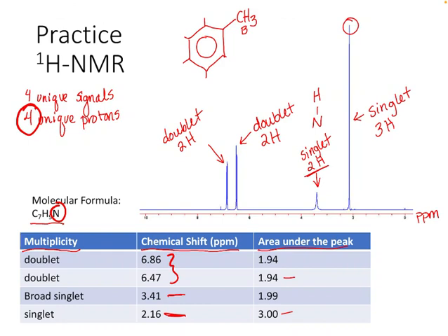Okay, so another possibility is that the nitrogen group, or the amine group, is 2 bonds away from where the methyl group is. And then we have our 4 protons again on the benzene ring. Again, those nitrogen protons we'll label A. Now let's look at our 4 protons on the benzene ring. Are they the same? Are they different? Are they all in different chemical environments?